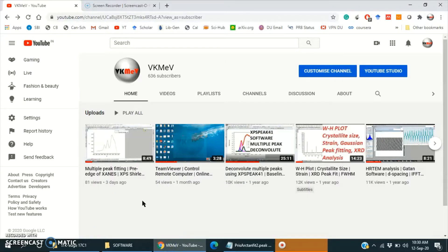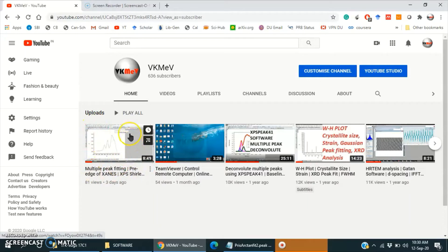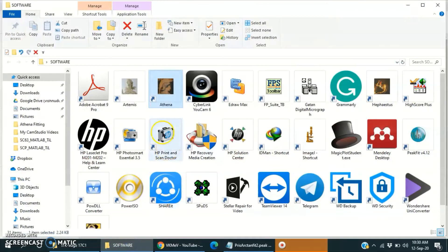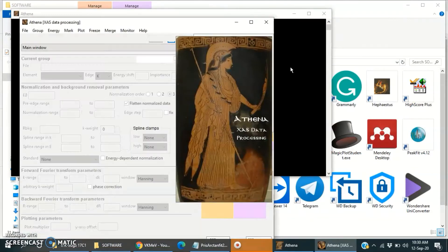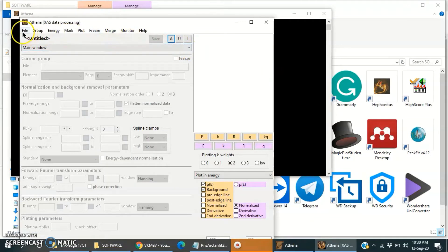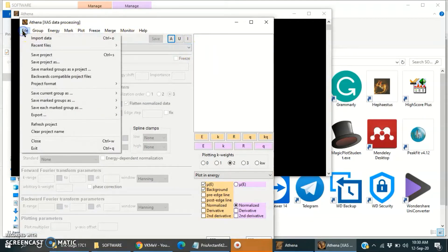Hello everyone. In my last video I used Origin software to deconvolute the L-edge region of titanium XANES spectra. In this video I am going to use Athena software for peak fitting. Let's start.